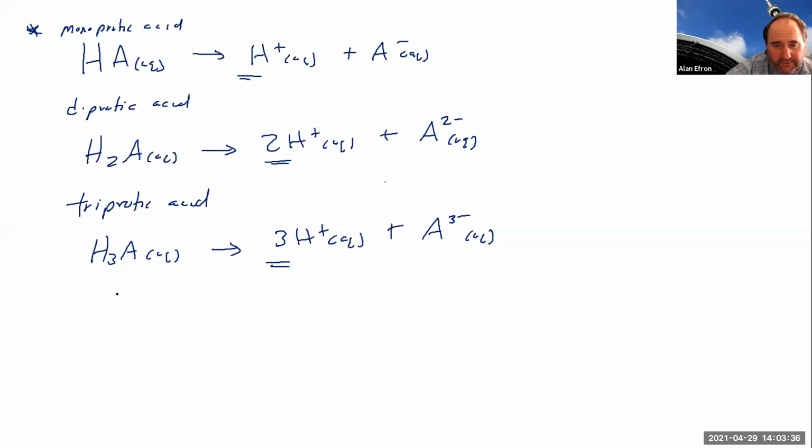That's essentially the whole ball of wax. You're basically going to be using this program to do these simulations and titrations. You will be recording information, so you'll find some notebook pages up on the module where you can record your measurements of pH and volumes along the way as you're doing your titrations. Remember as well, there are certain parts where it asks you to take a screenshot. So make sure you take those screenshots using the software along the way, and follow the instructions on that.